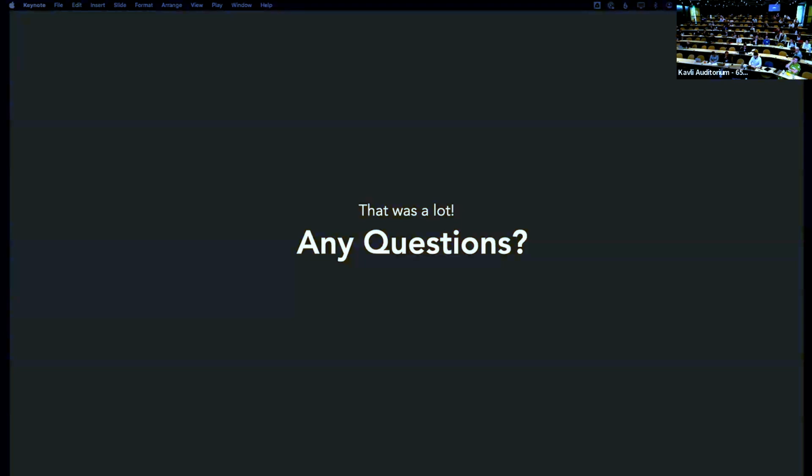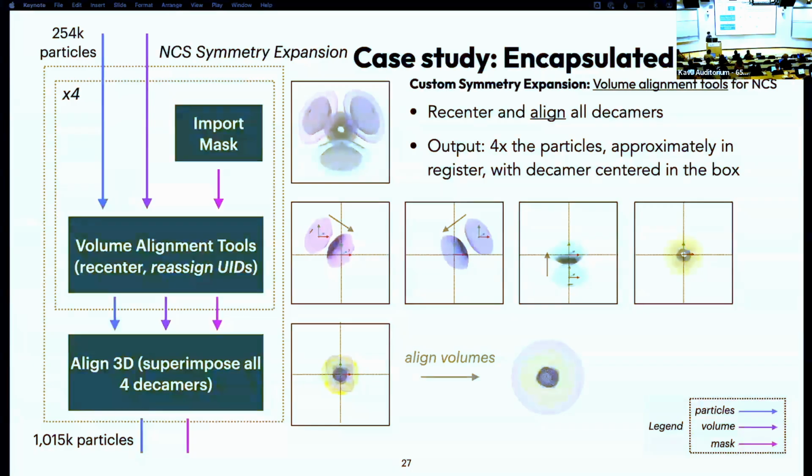Yeah, for sure. Actually, throughout this whole process, the poses were initially solved with the Encapsulin complex, but they were kept the whole way through. So the particles were always kept in register with the volume. Once we got the initial structure of the complex, we didn't throw away the poses and start from scratch again. I guess it would be possible to do that, but you would probably lose. I imagine that ab initio would struggle just a little bit with the fact that you're using subtracted images. Although, I don't know, it would be worth trying, I think. Yeah, I don't know if that answers your question.